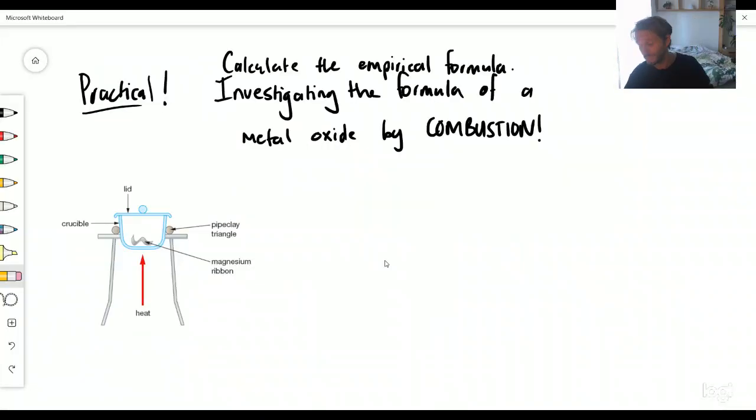The questions that they're going to ask you in the exam are going to come from the calculations of this experiment, not necessarily from the steps of the experiment. All right, so I'm going to go through the steps anyway. We've got one sip of coffee. Okay, all we've got here is an apparatus set up.